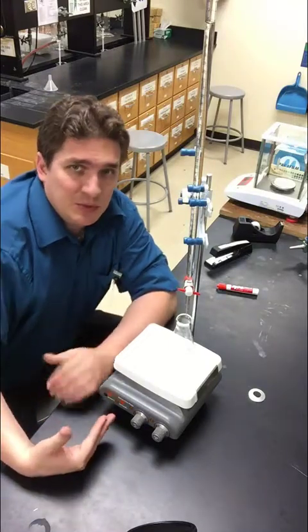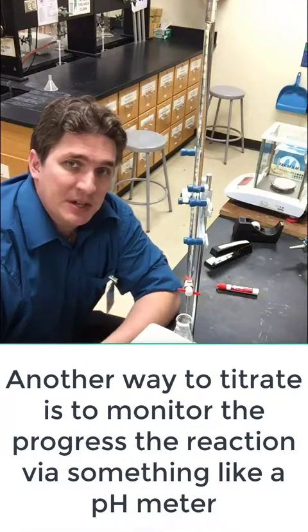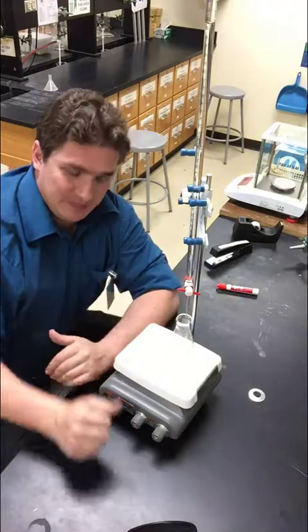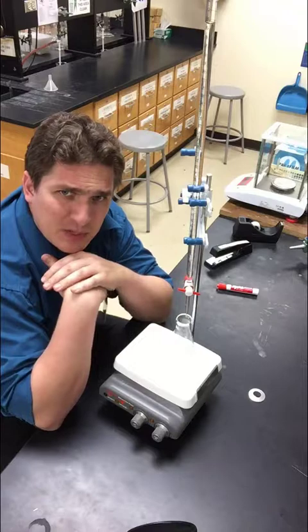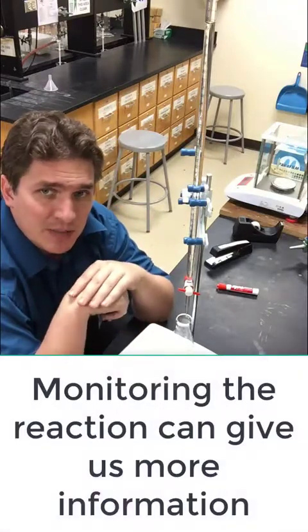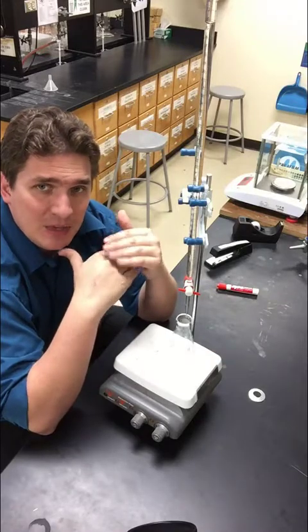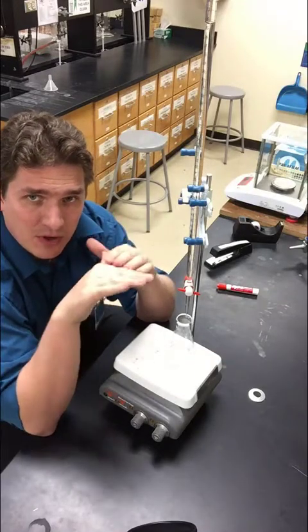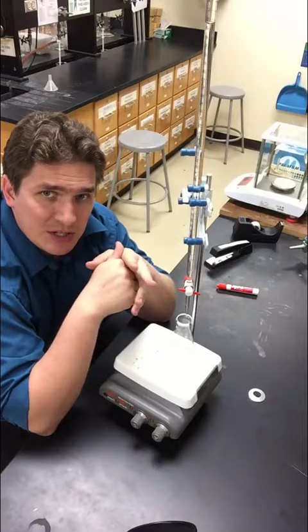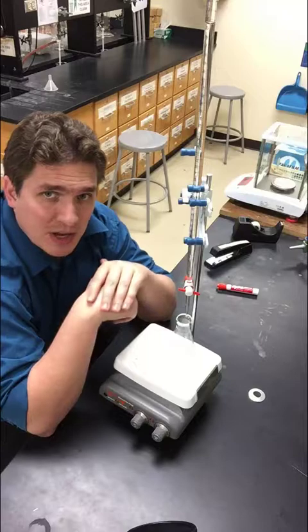The second option, which we do at the Chemistry 2 level, is sticking a pH meter in here, and we measure the pH as a function of volume of this additive. And the idea behind that is that we can get out more information. So if we look at pH versus volume, which we'll talk about in a later video, what we'll see is that we can connect the pH as a function of volume to the Ka, the ionization constant or the dissociation constant or the equilibrium constant of the weak acid, as well as its concentration.